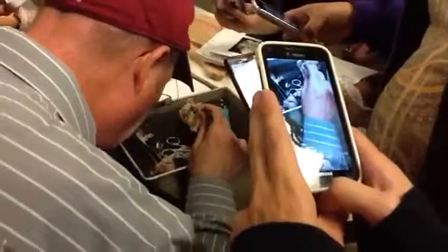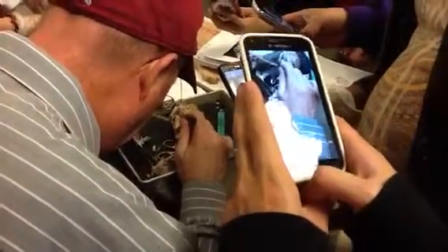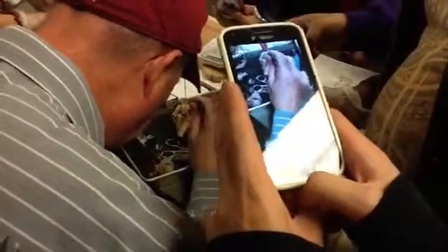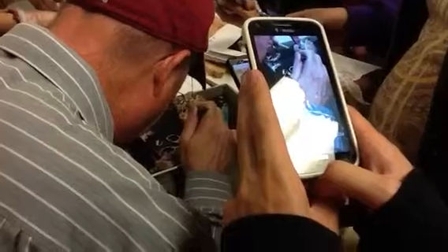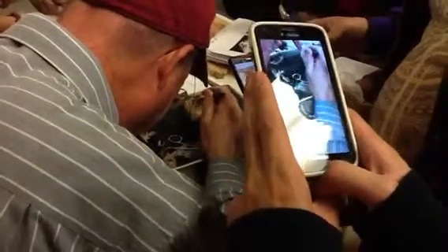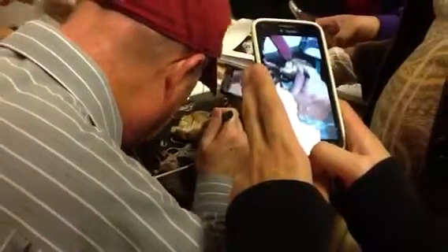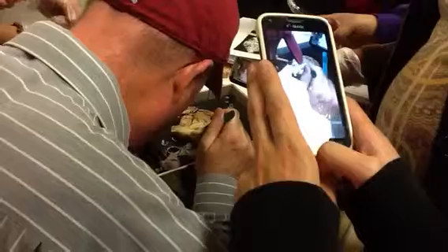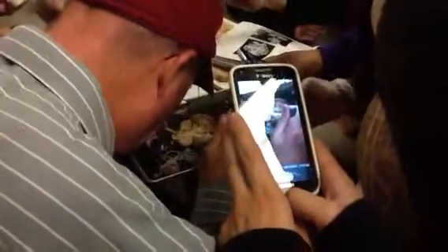Okay. And the pons is right here. Then the midbrain, just a minute. Midbrain is up in here. Okay, this is the midbrain. Right here. You can see the colliculi. Right here, midbrain.